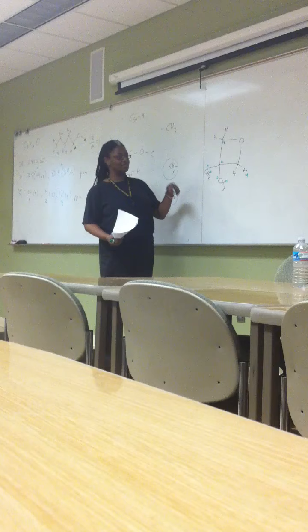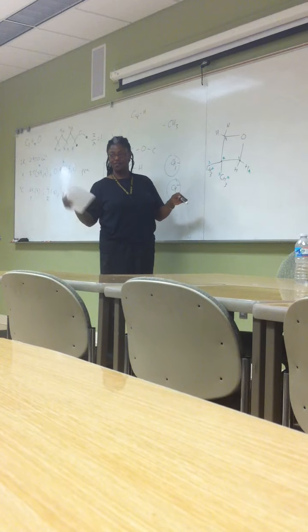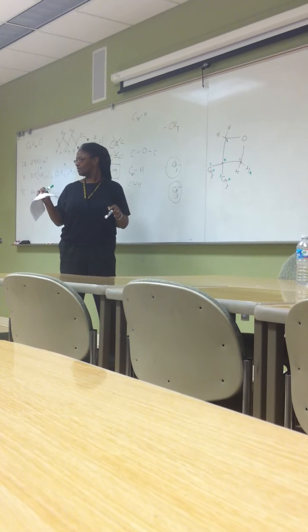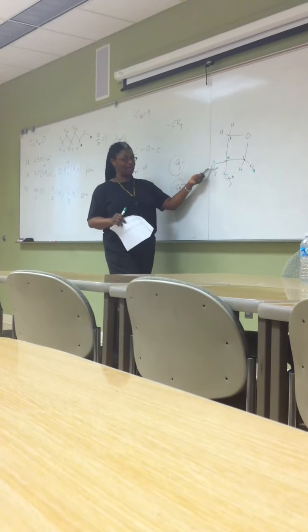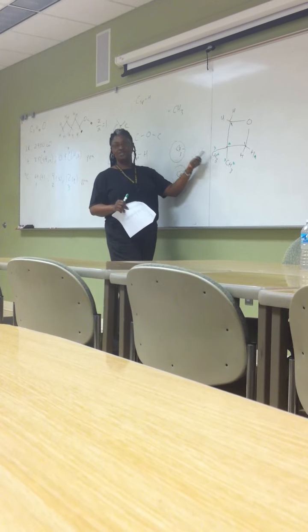This is off-resonance decoupling, where all the examples I gave you had splitting on the carbons, meaning you're allowing the spin to couple with hydrogens that are attached.